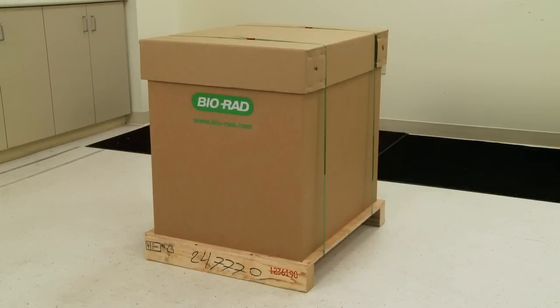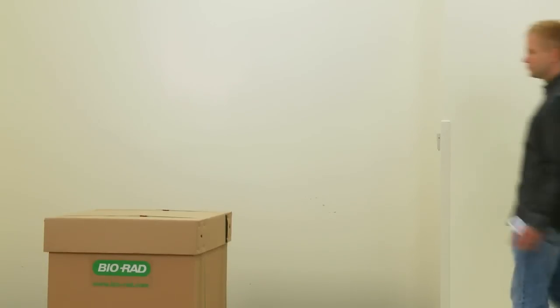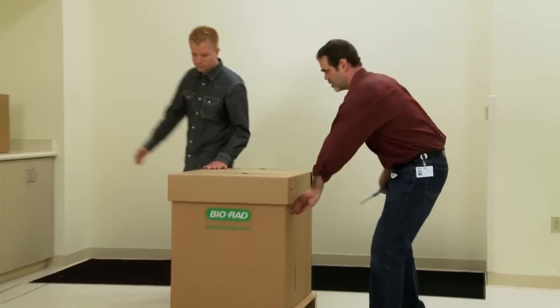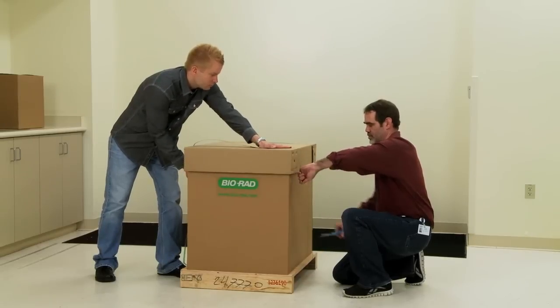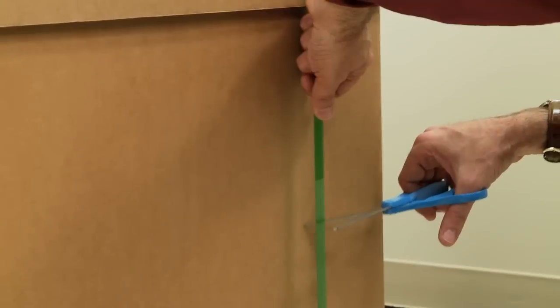Your NGC system arrives in a 31 by 28 by 45.5 inch box. Use the help of another person and a pallet dolly to move it to your lab space. You will want to remove the outer box straps first.